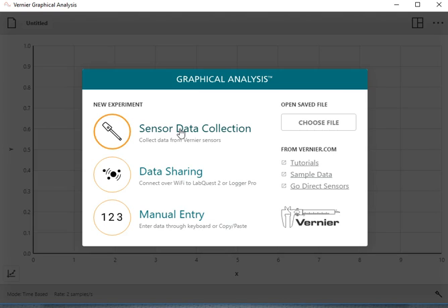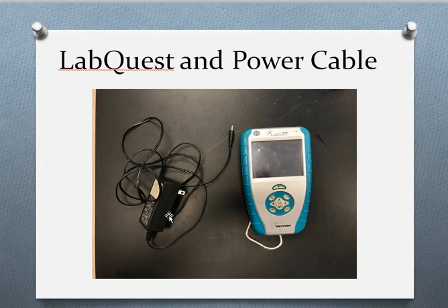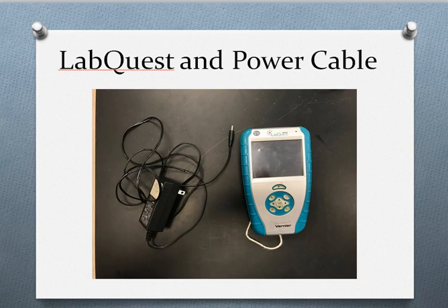I wanted to show you the various pieces of equipment we're going to use. There's basically one LabQuest device and three different cords: one is a power cord, one is the temperature probe, and one is the USB cord which connects the LabQuest — which has the temperature probe — to the Chromebook. Let me bring those up one at a time. This is the LabQuest device, and this is the power cord.